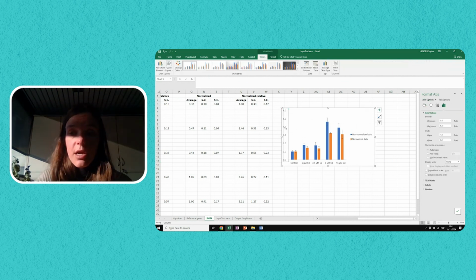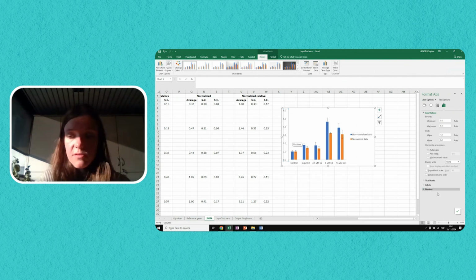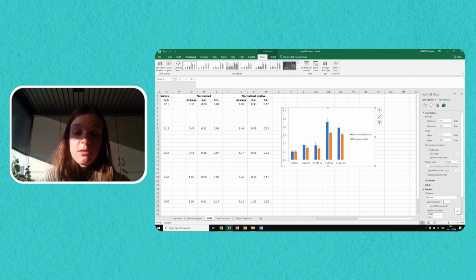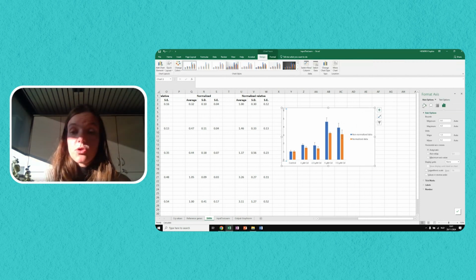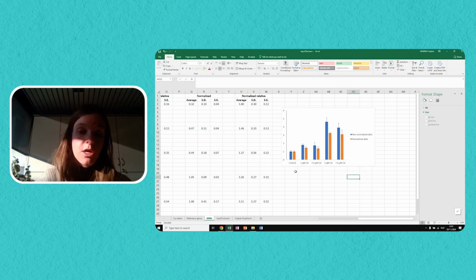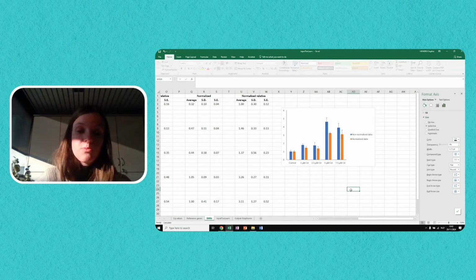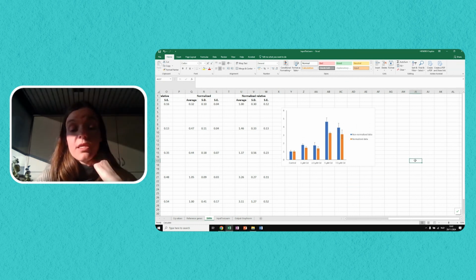Then here, I will still change some things about the axis. So now I see that the axis labels have changed a bit. So now the decimal numbers here at the end also don't really have any additional meaning. So I will remove the decimals so that we just have values ranging from 0 to 6. And then I will also give this axis a color. You see now it's white, but I will change it to black to make it clear that these are the axes. So I do this both for the x-axis and the y-axis. And now our figure is ready.